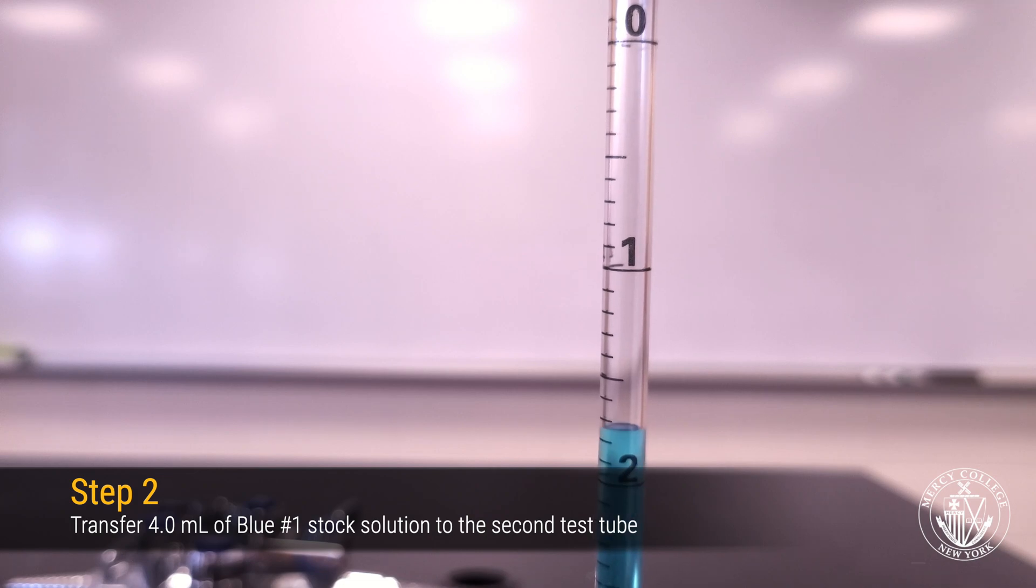Now, draw up 4 milliliters of the stock solution and transfer it to your second test tube.